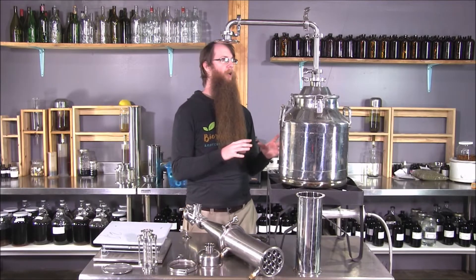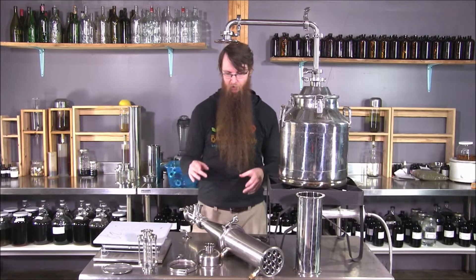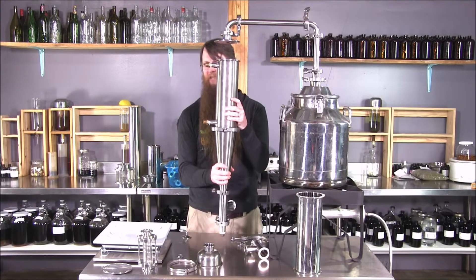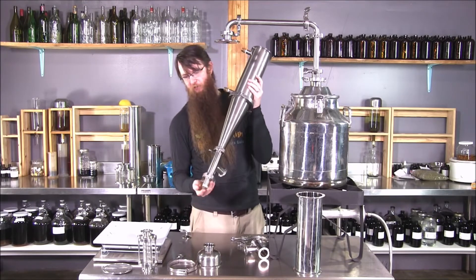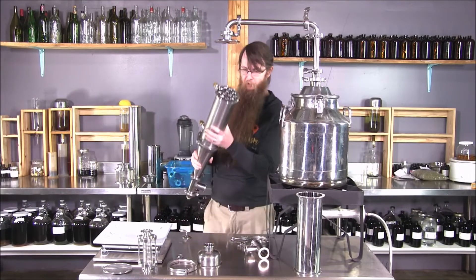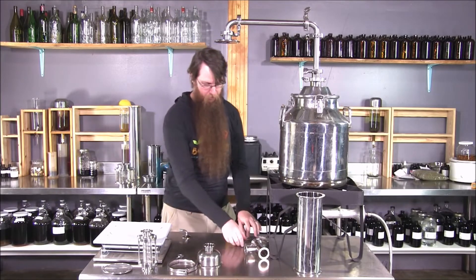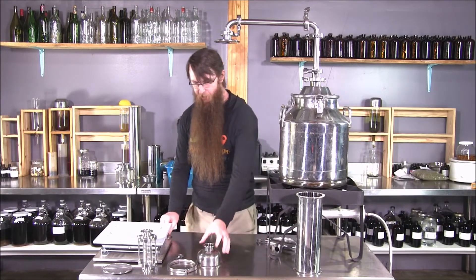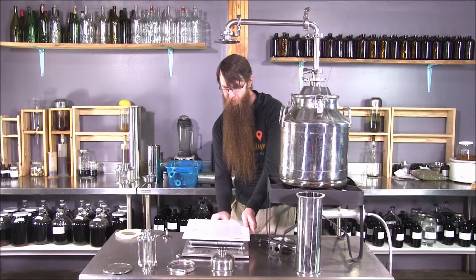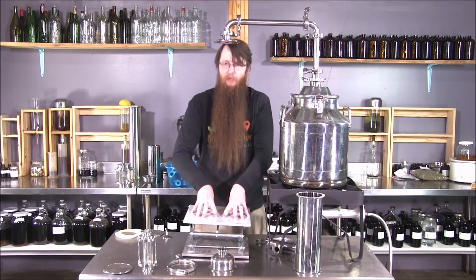I'm in the middle of setting up a tri-clamp stainless distilling setup and I need to get my condenser up this high, but it's really heavy and so it needs the base supported. I've kind of capped off a base here that can set on something sturdy, but I need to get it up. So instead of stacking wood or bricks or any number of things to get to the right height, I have found that an adjustable lab stand is wonderful for this. It raises and lowers very easily without weight on it, but once there's weight on it, it locks in place and doesn't go anywhere.